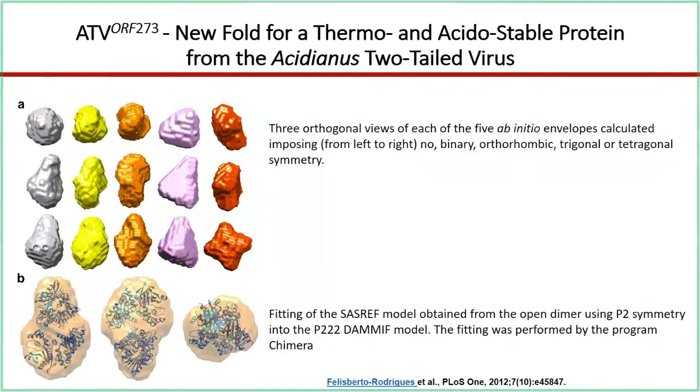And some of the pHs that were involved in crystallization, they failed in SAXS because the protein was aggregating at those pHs, and batch mode SAXS was not possible. So I think under current circumstances, these experiments would have gone slightly differently. Nevertheless, the discrepancy they saw was under crystallization conditions.